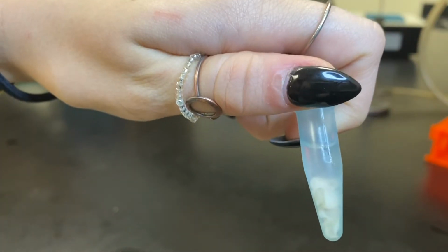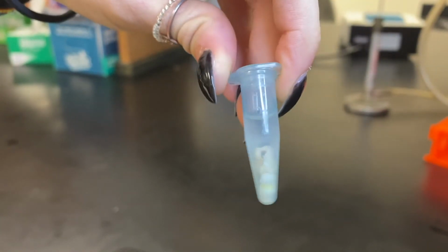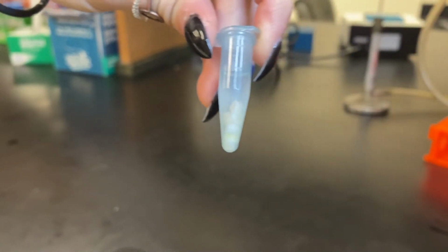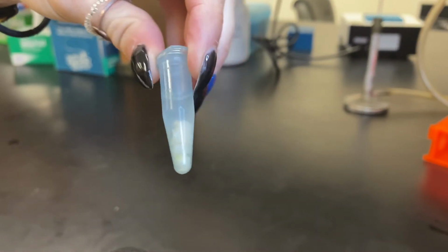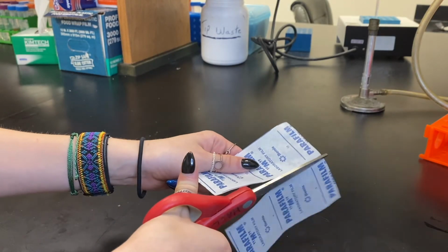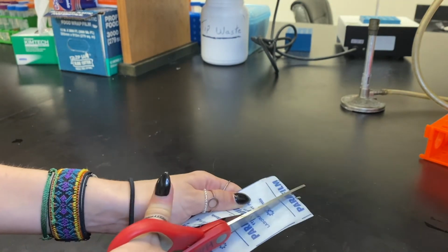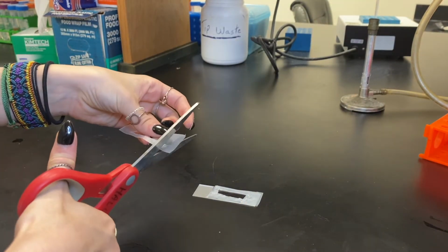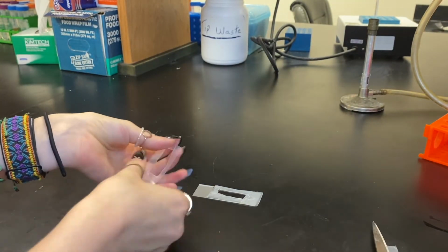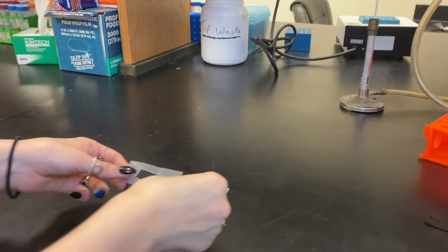After the 3 weeks were up, things were not looking so good. The slices look rather mushy, and I'm worried what I thought would happen, mold, has happened. But I went ahead and started prepping a slide anyway. Mounting was going to be tricky. The slice was supposedly 400 microns thick, and a cover slip would not be able to stick to the slide. I started fashioning this parafilm-lined slide, leaving a gap in the middle for the brain to sit. Hopefully, this added height would help prop up the cover slip against the thick slice.